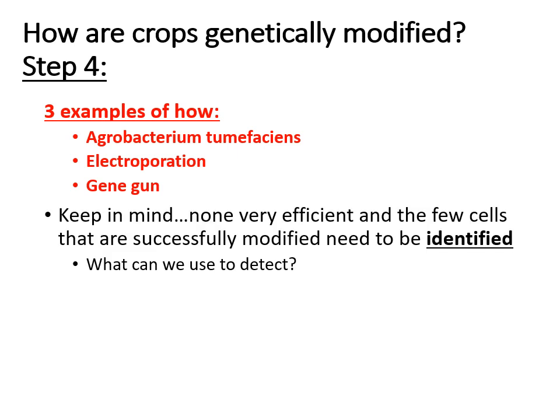Now please keep in mind that with any of these, none of them is going to be perfect. You actually won't get a lot of DNA that successfully goes into plant cells. So you basically, just like when we talked about in transformation, need to be able to quickly identify and detect which of those few cells actually got the target DNA into it, you know, your plasmid and your modified genes.